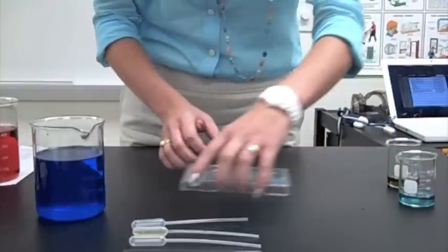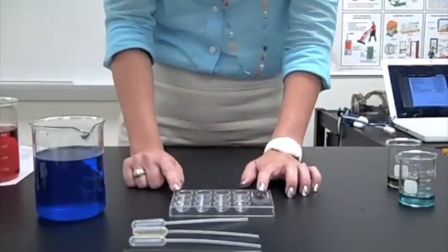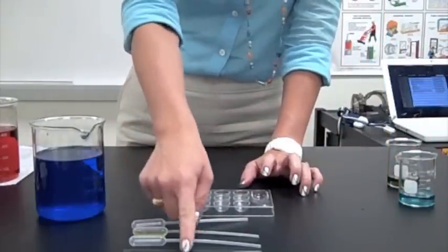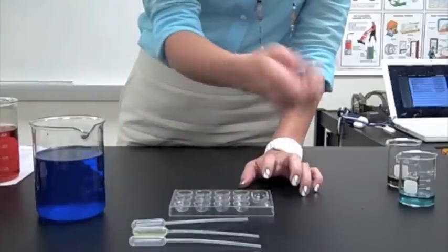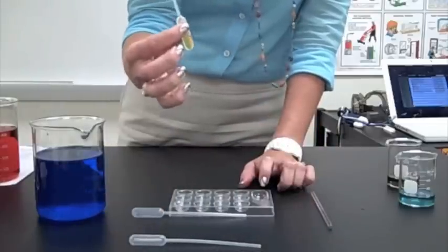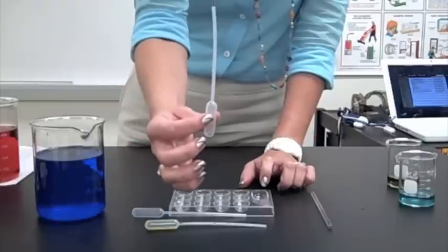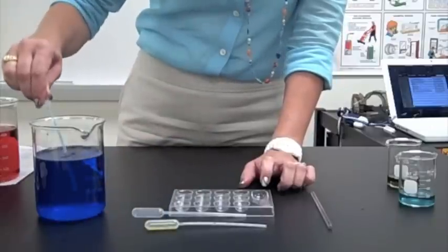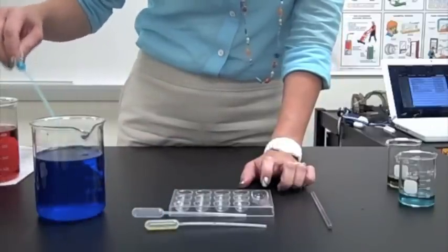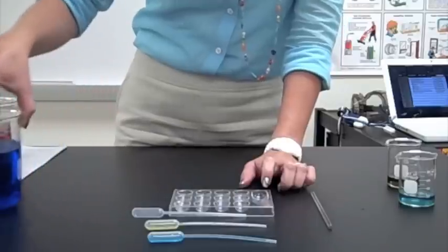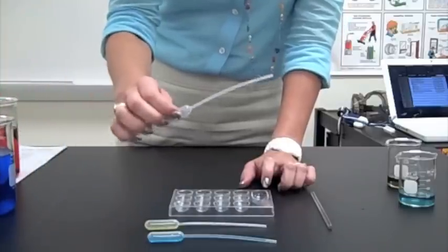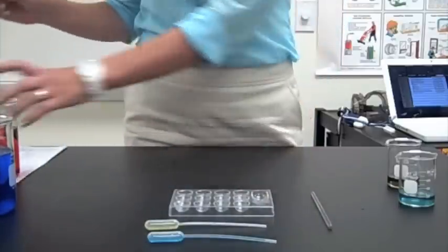Now, we're going to move on to the micro scale techniques, which is where we need the 12 well plate, our three pipettes, and our glass stir rod. I already have the yellow one slightly filled. This is the blue one that I used a second ago. I'm going to use that to get some more blue solution. And then I'm going to use the one that I haven't used at all yet to get our red solution.